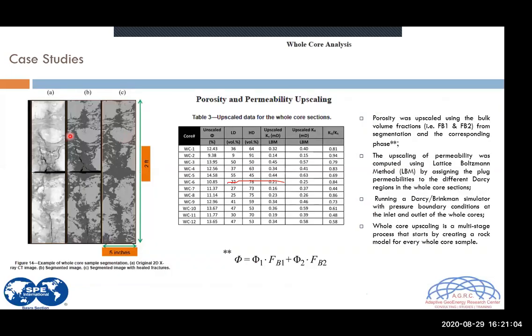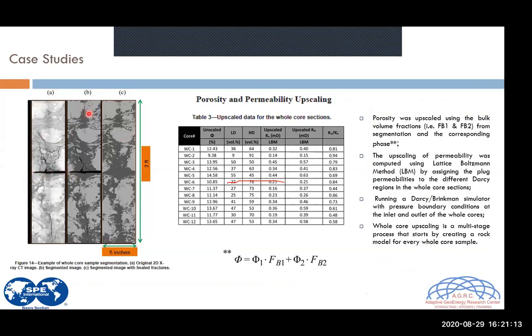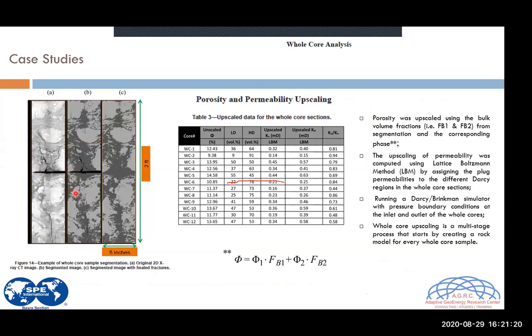And one of the things that can be done using the digital rock approach, for example, here we have this kind of fracture sample. Yeah? One of the possibilities is to try, what they call in the paper, to heal the fracture. Yeah? So you try to understand the main features in our sample in a 2D section, for example, and we try to reconstruct the original sample without the fractures. It can be done in the 2D sections and then modeling for the 3D distribution as well.